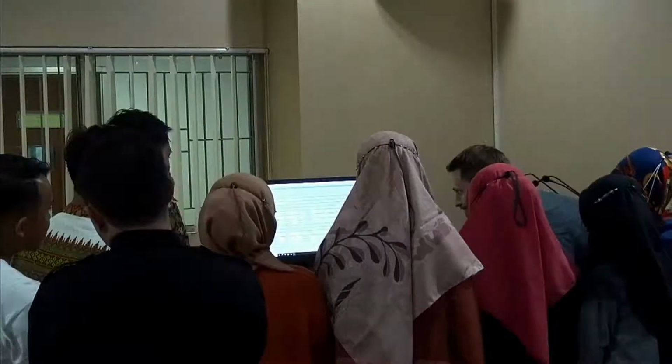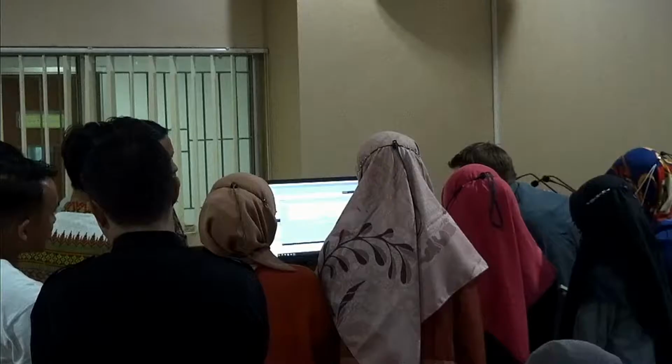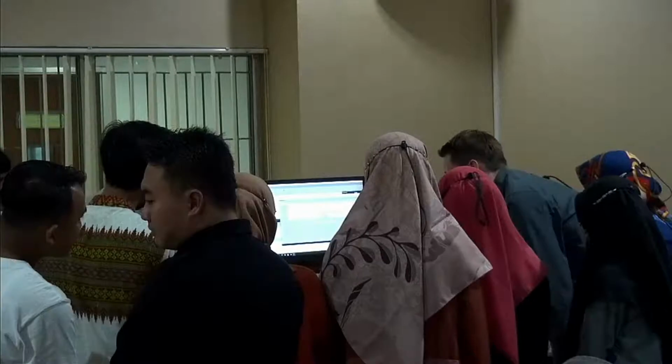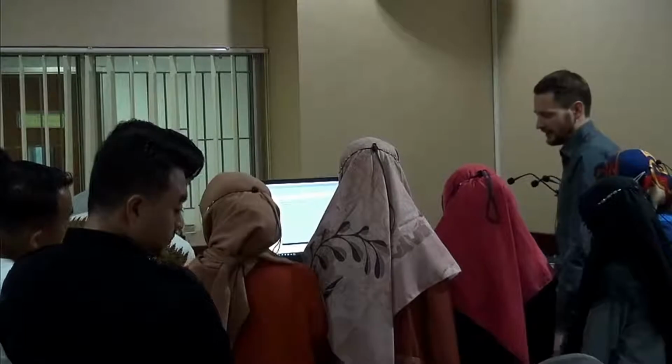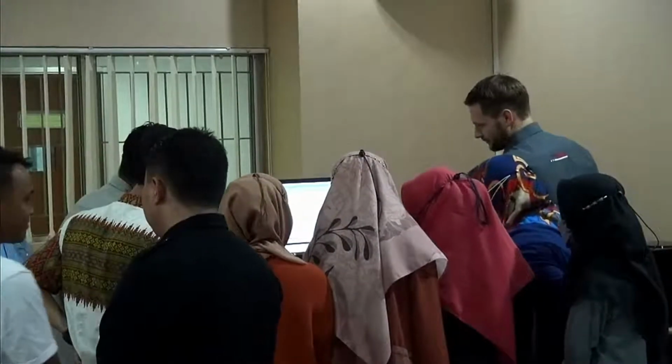In that case, okay, we have our parameters, so we click Start. We can now enter a name for our measurement. In this case, let's call it F500. That is basically the name of this material. And now the instrument will start working. Pump is on. We set it to pump speed of 40. You hear the ultrasonic going on.